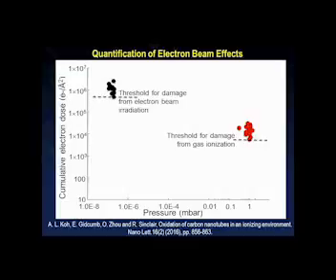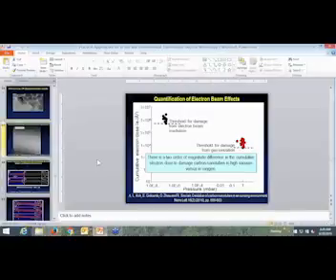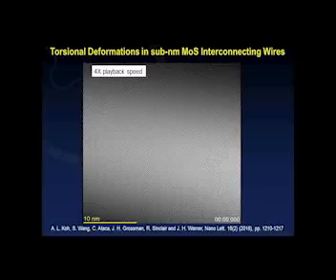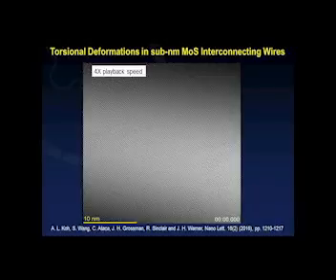So as you can imagine, with these in-situ recordings, if you record at 4K by 4K resolution, you would end up with an image which is about 65, 66 megabytes multiplied by 25, and that is the sort of data size that you would need to manage. 66 multiplied by 25 megabytes is the data size per second.